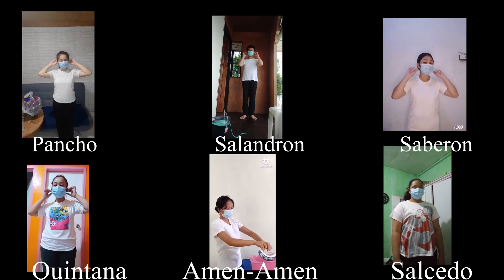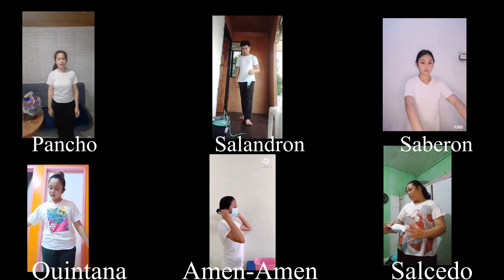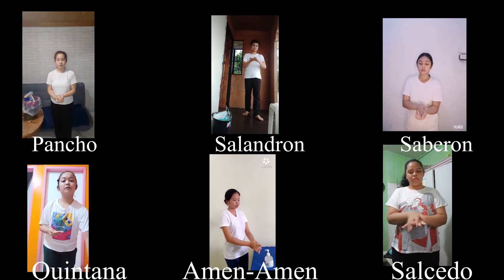Next, remove and discard the respirator or face mask. If you are wearing a face mask, carefully untie the straps or unhook them from your ears and pull the mask away from your face without touching the front of the mask.